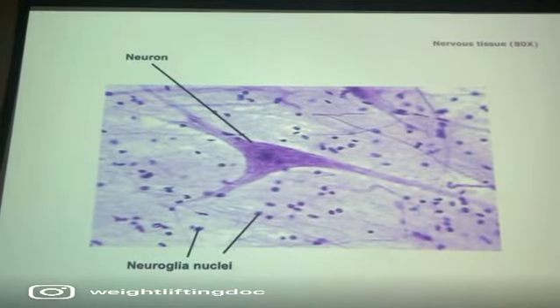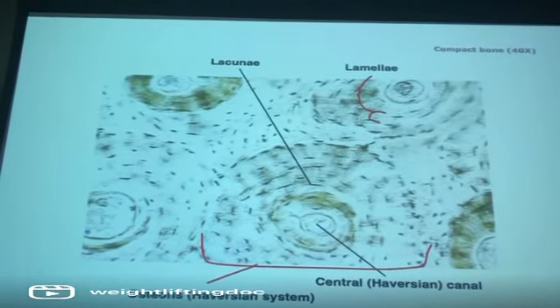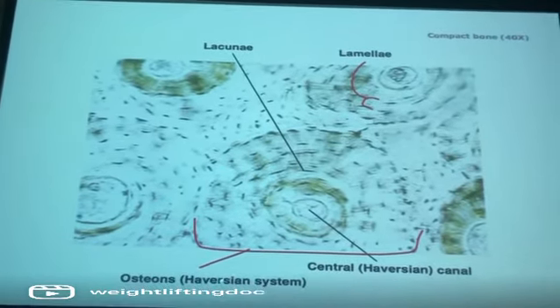And each of the rings, so between the lacuna, right, so like if you look here, how I bracketed that, it's called a lamella. And that's not just this portion, it's this whole ring that goes around. Okay? It's the ring of bone. So the rings of bone that make up the osteon are the lamella, and the lamella are made up of these lacunae. Okay? Another name for osteon is the Haversian system. You can use that as well. If you go to the center, you have what's called the central canal, which is also called a Haversian canal.